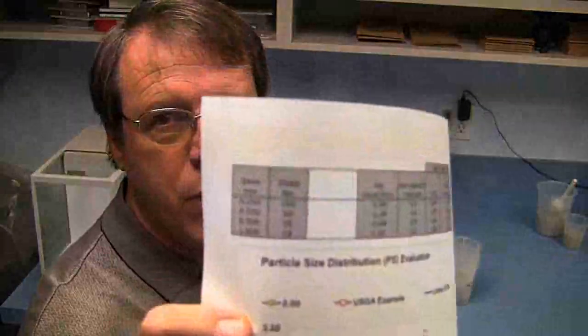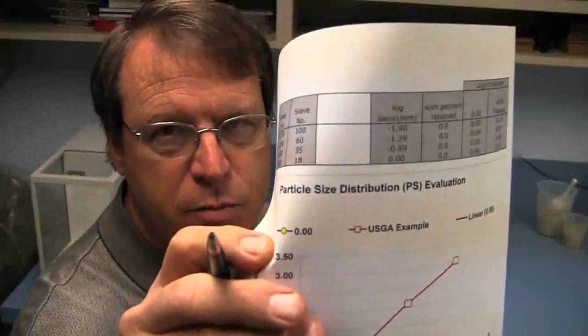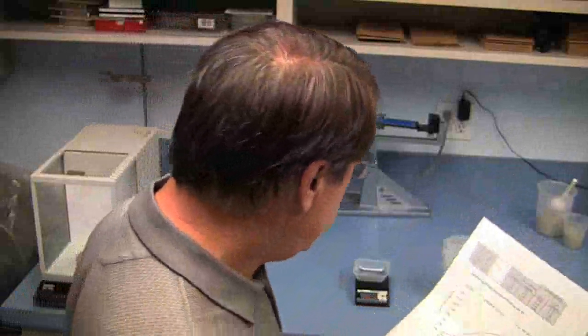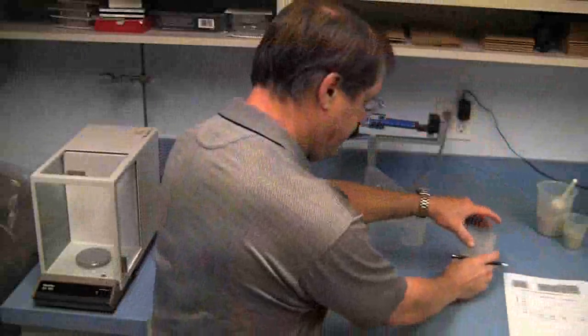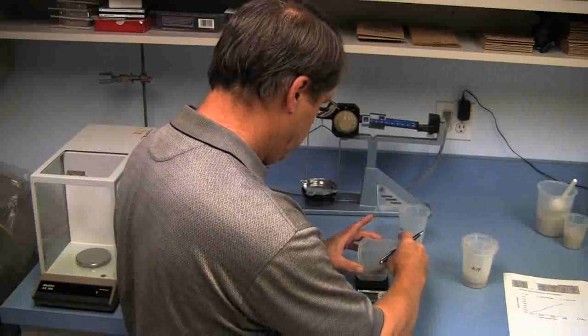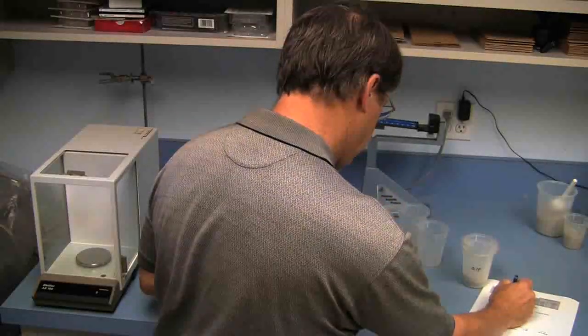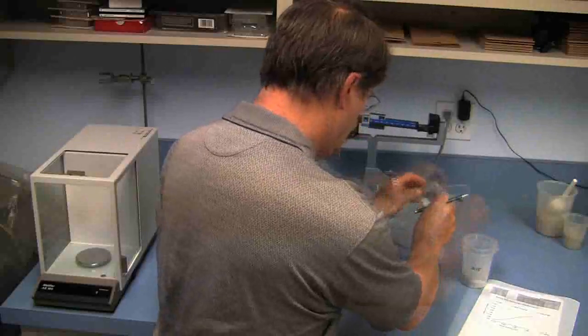So now we're going to weigh and record the values. I'm using a printout from the spreadsheet that's provided. A link's provided in this update so that you can just write the numbers down on here and then enter them into the computer to give you a good QC value. So we'll weigh each one of the sieves from the 0.15, 0.25, 0.5 and 1 millimeter samples. Okay, it's easy as that, now let's plug the numbers into the spreadsheet and see what we come up with.